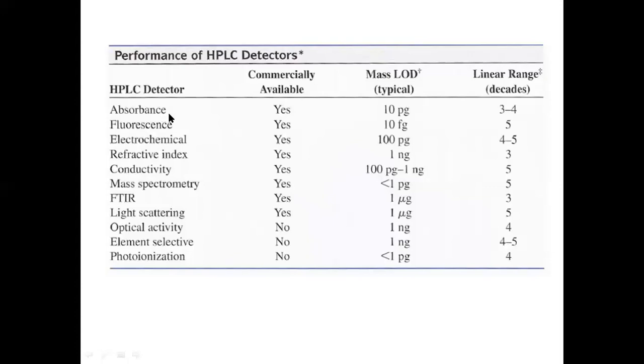So the range is fixed for all those organic molecules. So what should be the range of wavelength that is going to be absorbed by the organic molecule? If the molecule is simply aromatic, what is going to be the wavelength range? If the molecule is containing unsaturated ketone groups or aldehyde groups, what is going to be the absorption maximum? If the compound is containing more than one exocyclic double bond, what is going to be the lambda max? These are the things we have studied under UV absorption spectroscopy. So this is the principle of the absorption detector. It is going to function.